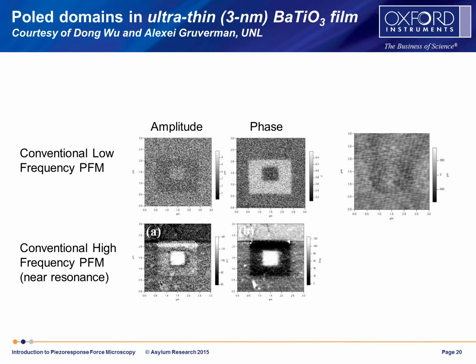As another example, I'm going to go back to that thin film barium titanate sample that I showed you in the beginning. This was the low frequency PFM, so far away from resonance, and you can remember that signal to noise was rather poor. At the same time, at least we get something like a 180-degree phase shift and the amplitudes in the noise. But this one was actually made near resonance.